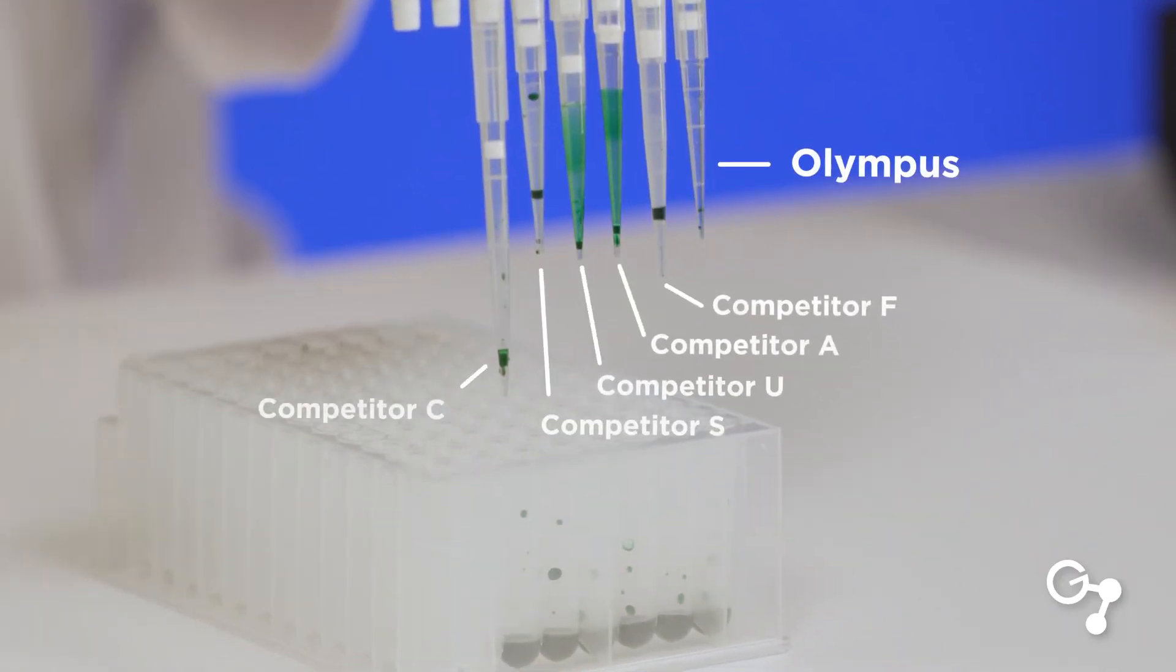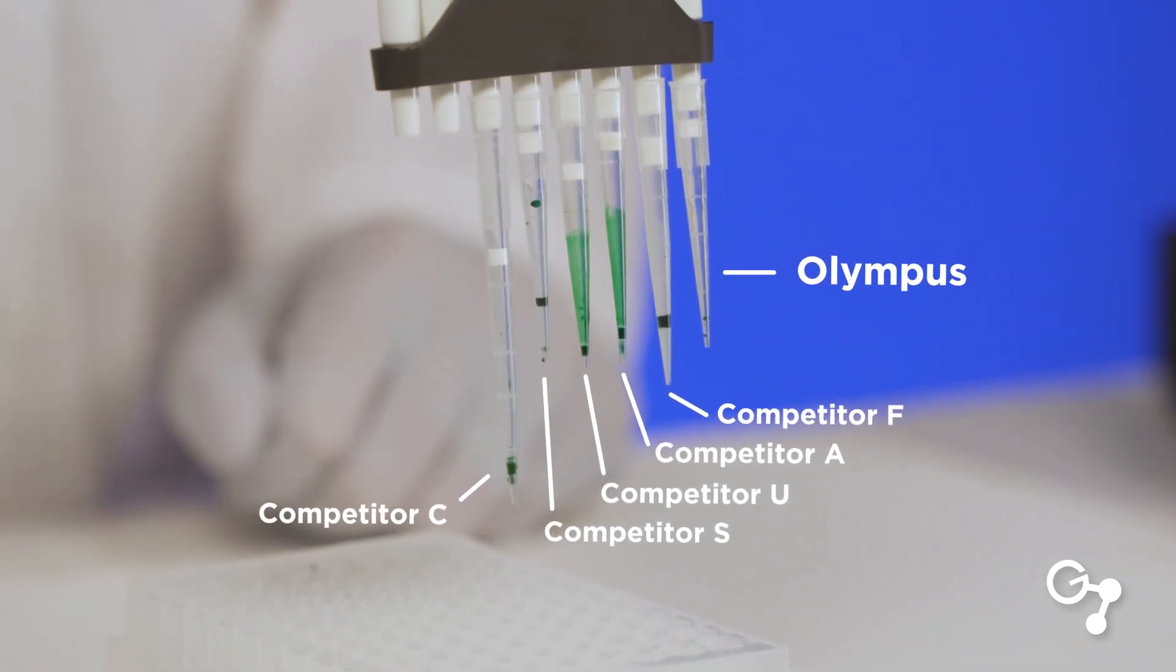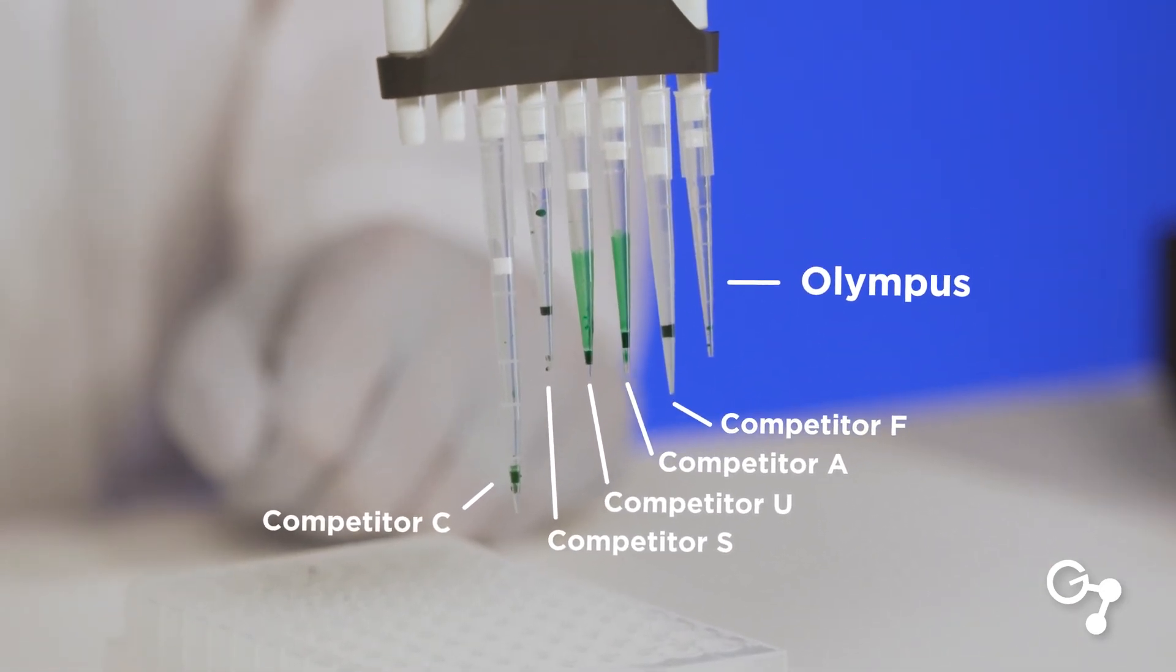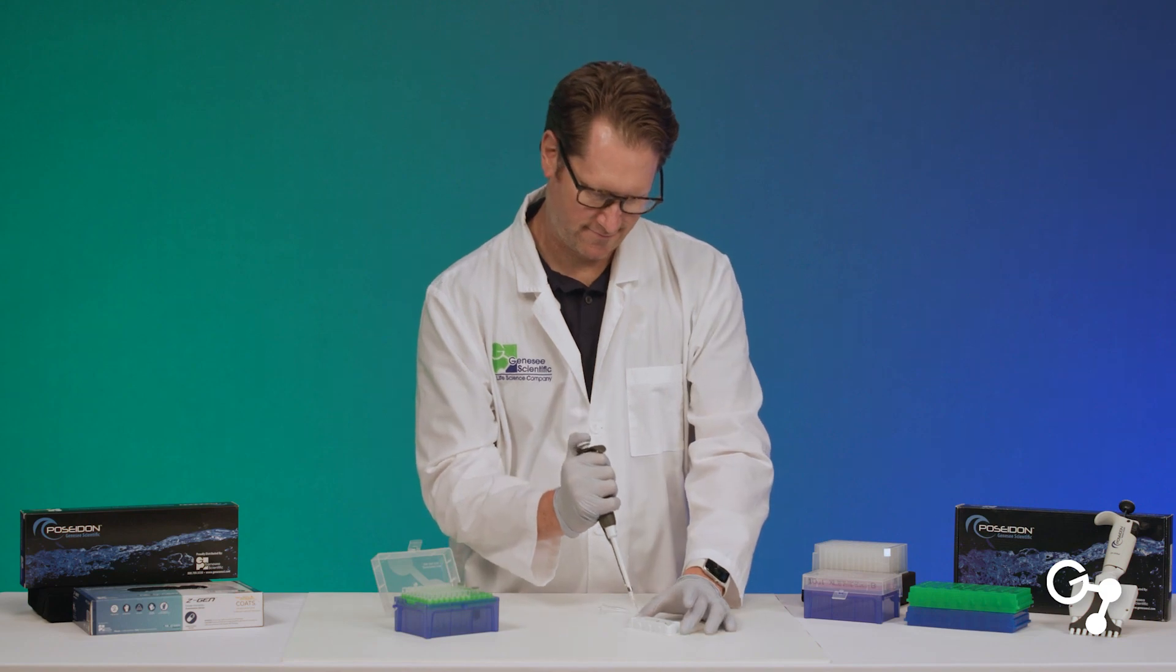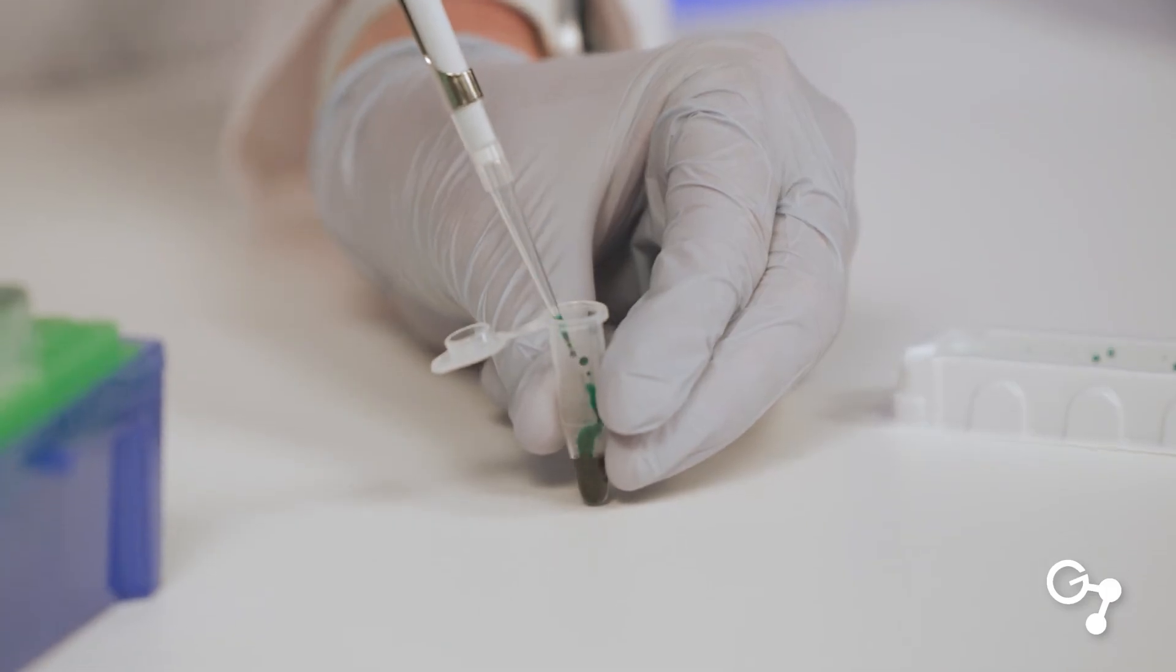Olympus tips perform equal to or better than other brands, and for a competitive price. Don't believe us? Ask your Genesee sales rep for sample tips so you can run your own experiment.